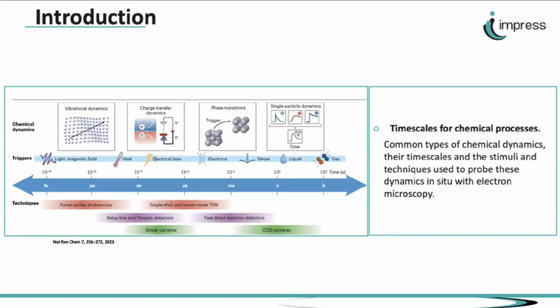Okay, when we talk about time resolved measurement in TEM, indeed, we are going to study a specimen before and after the transition. What do you mean by this?